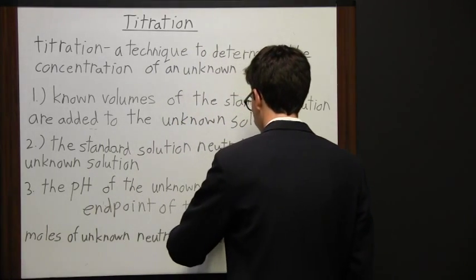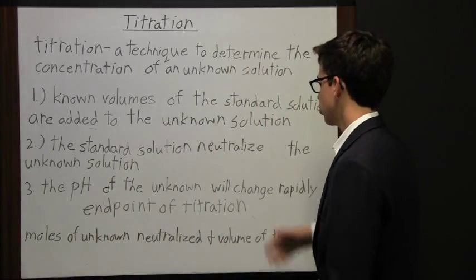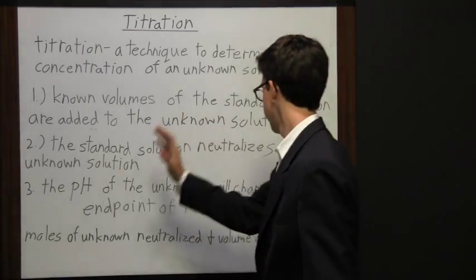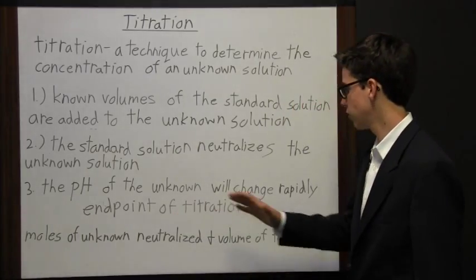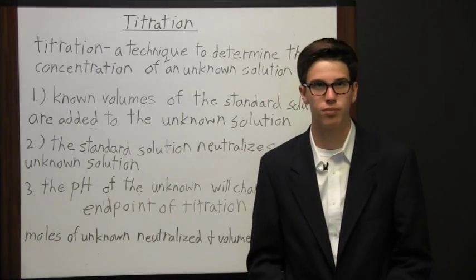So this is the endpoint of this technique we were using, because the standard solution neutralizes the unknown solution. And so at that point, the pH of the unknown is changing rapidly, so that signals the endpoint of titration. It signals that this process, this technique, is over.